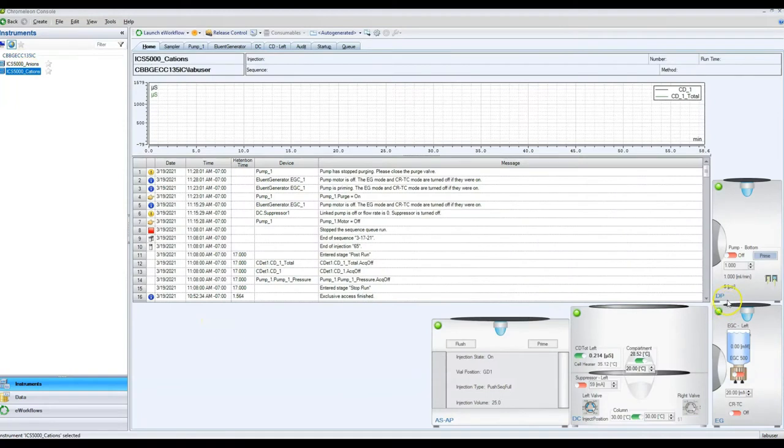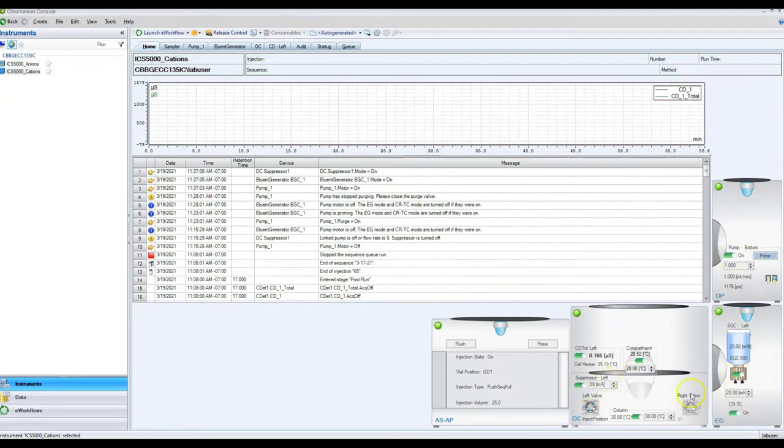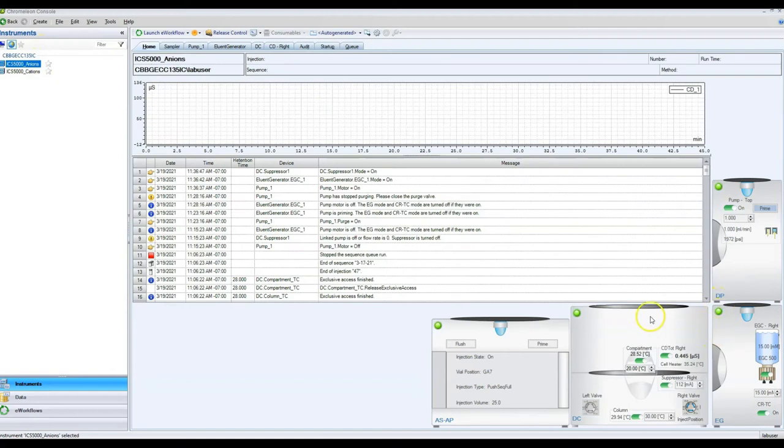For the cation side the pump is still 1 mL per minute, eluent generator is 20 mM, and suppressor is 59 mA. Normally when the machine is in idle mode these will be at lower values — about 0.1 flow, 5 mM eluent, and 5 mA suppressor. If you do plan on using a different run program, you can find it in the Data tab, open it, and dig through it to find the settings you want.